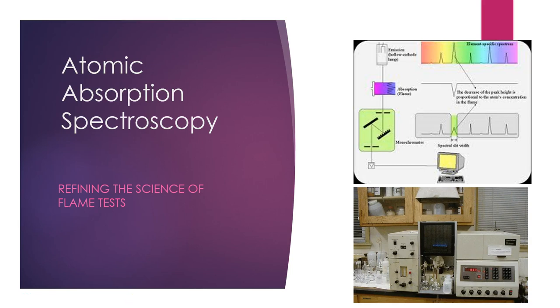Hello, so today we're going to be talking about atomic absorption spectroscopy. And if you watch the introduction to spectroscopy video, you'll know that spectroscopy is looking at the way that different atoms and molecules interact with light. This means that we're going to refine the idea of flame tests that we've looked at in the past and see how that can be used analytically.